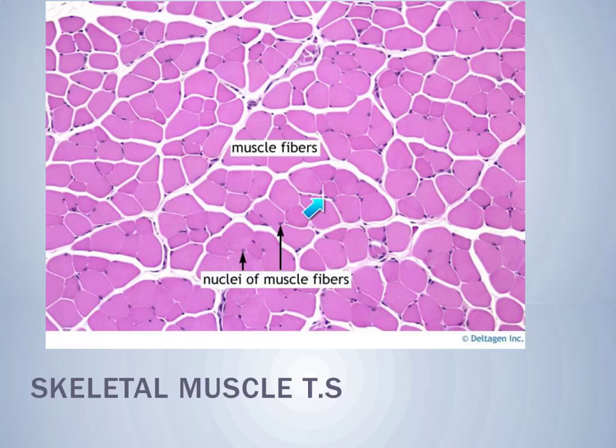This one is the perimysium, formed of less dense connective tissue and containing blood vessels and nerves. And then we have the very fine reticular connective tissue in between individual muscle fibers, surrounding them. This is the endomysium, containing fine blood vessels and nerves. Here we have a blood vessel, which is present in the perimysium and the epimysium. You cannot judge where the epimysium is because I cannot see the whole surface of the muscle. So we have perimysium and endomysium.